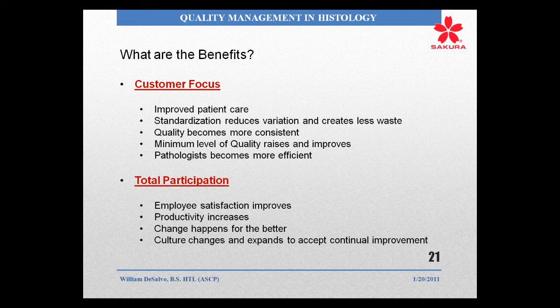And the two biggest wastes that you have in your laboratory are time, loss of time, and the defects, which is directly linked to loss of time. Quality becomes more consistent. Again, a standardized approach leads to standardized results. Minimum quality, a level of quality will raise and improve, absolutely. Even the smallest changes can help you move that minimum level of quality.